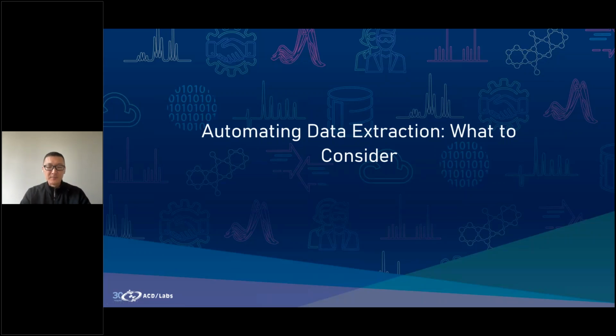Thanks, Anne-Marie. So what Anne-Marie spoke about in the last few minutes was really discussing how the end user will interact with that data. The scientists in the lab, they'll need access to chromatograms, spectra, tabular results, how they want to interact with it in terms of whether it's a Windows client or a web browser, but it is all very manual in terms of picking out that data, which data set within that CDS system, and how you want to visualize it.